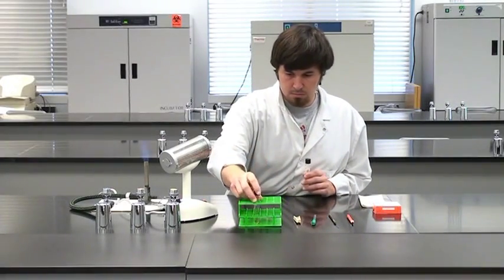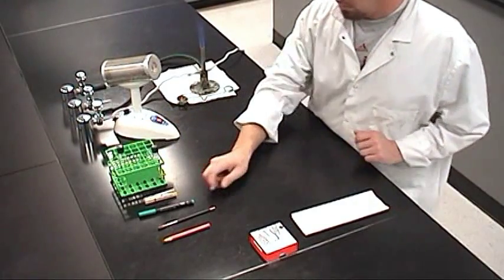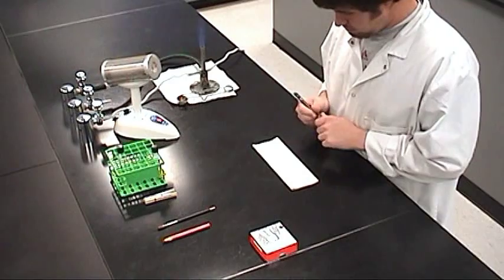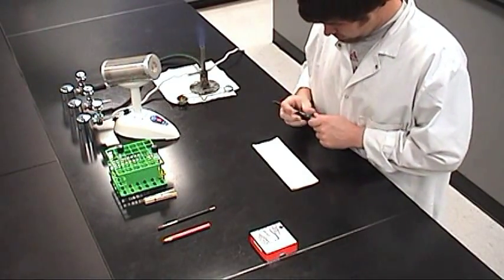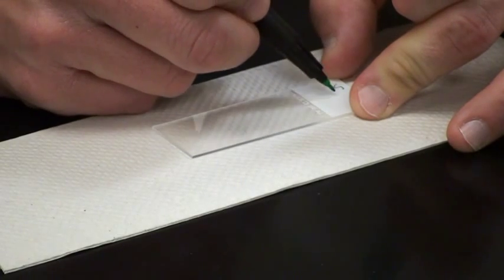Store the culture tube in the tube rack until you are ready to take a sample. Start by preparing the slide. Use the permanent marker to write the name of the specimen on the frosted end of the slide.